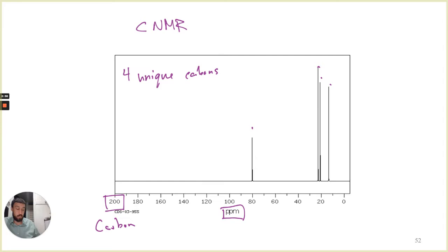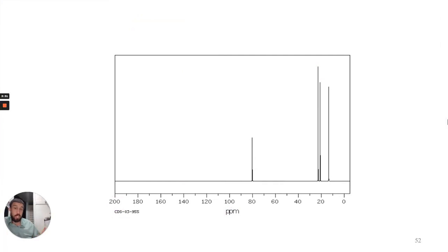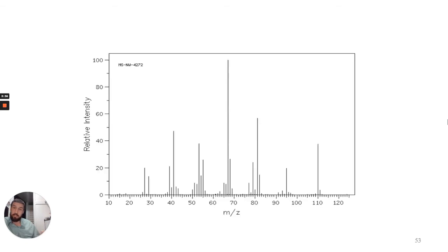The next part would be their chemical shifts. If I remember correctly, I think it's that 50 line. Oof, I should go back and review that. Sub 50, we're looking at our alkanes. And I believe we need to be at least 100 on to be looking at our alkenes or aromatics, so our double bonds, which means that last one is who knows? I don't. And that's it. Okay. Which then means we move on to our next spectra, for you to tell me. 30 seconds again.